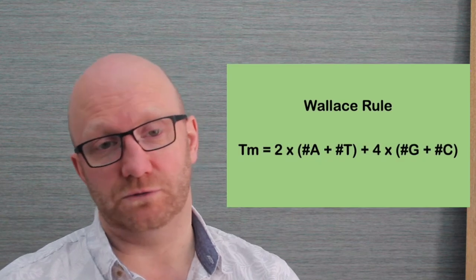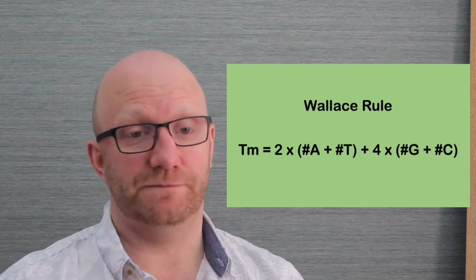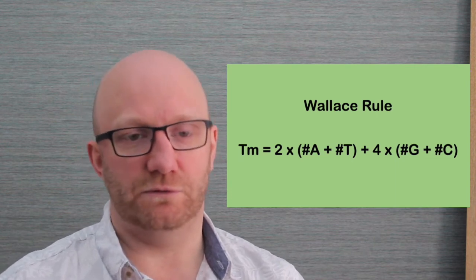So how do you work out the annealing temperature? Well, basically, nowadays there's just lots of software or online tools that you can plug your sequence into and it'll tell you. But you can get a quick estimate using what's known as the Wallace rule. And that's to count up the number of A's and T's, add them together and multiply them by 2. And then count the numbers of G's and C's, add them together and multiply that number by 4, then add those 2 numbers together. This rule comes from calculating probes in very specific buffer situations, so it's not really accurate all the time. It can give you a rough approximation, but it's a good place to start.